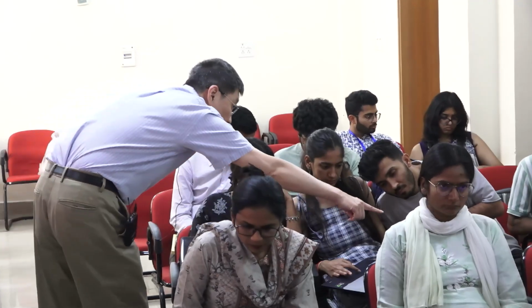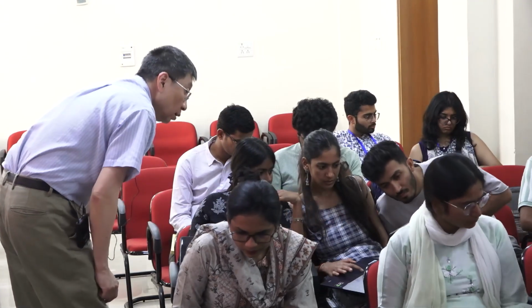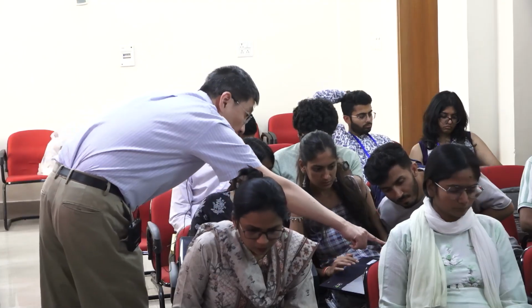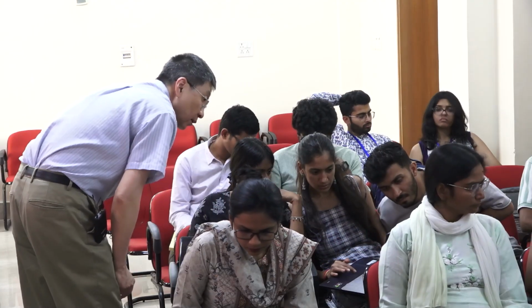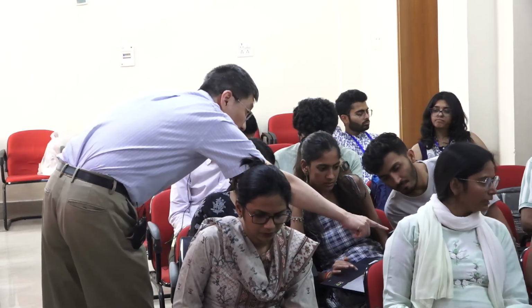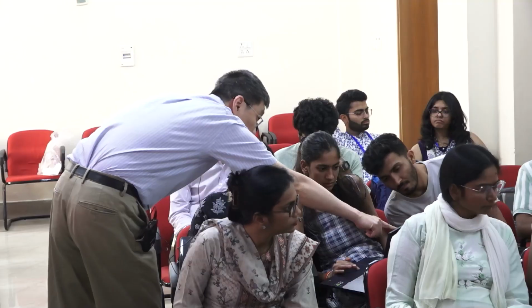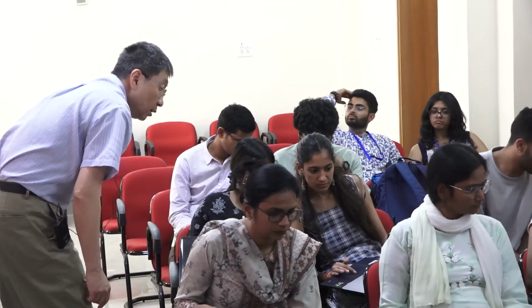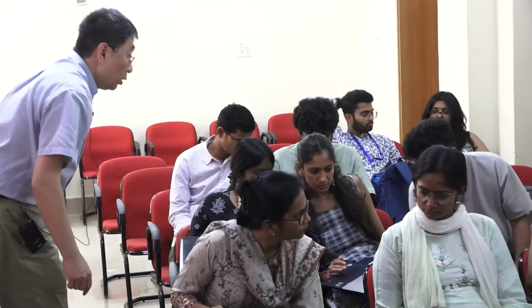No. Click on the sequence. Do you see a phenylalanine? Yeah. There you go. You have selected it. And now show as sticks. Yeah. And then do the same for the other sequence. The one above it. There's a phenylalanine above it. Do the same. Yeah, there you go. Now you can morph back and forth. Yeah, I don't know about the trackpad, what happened there.